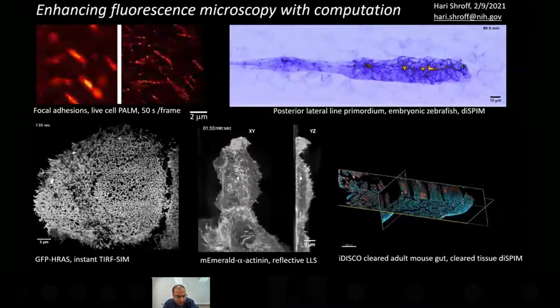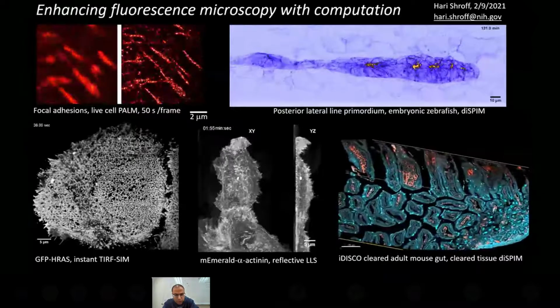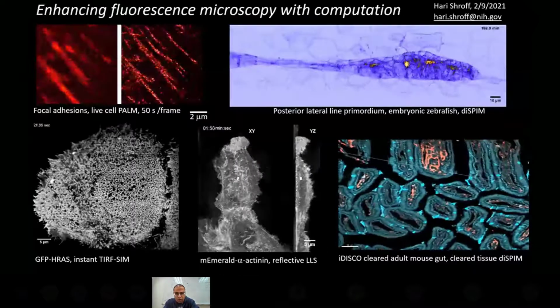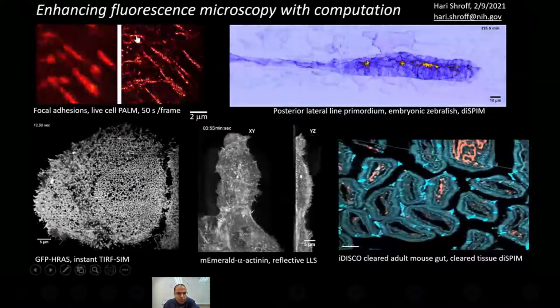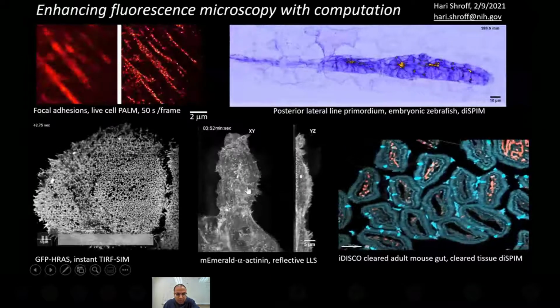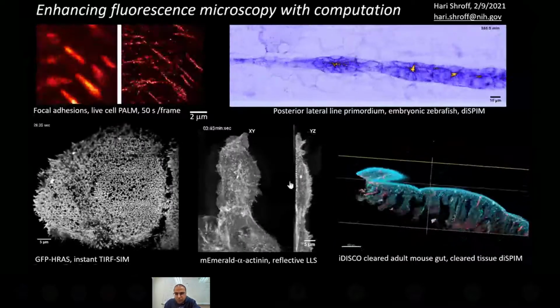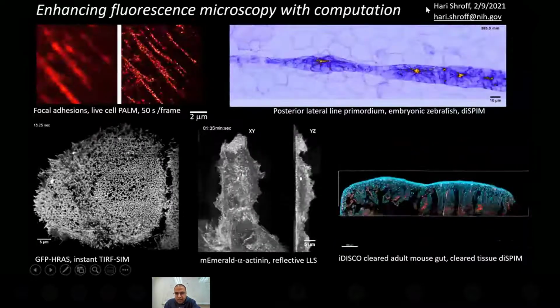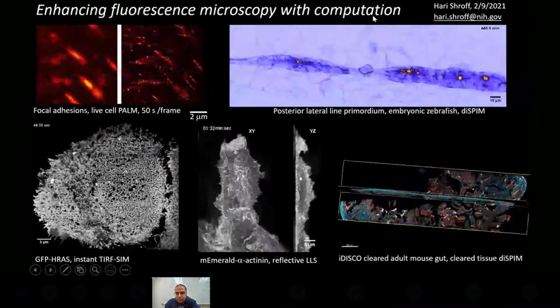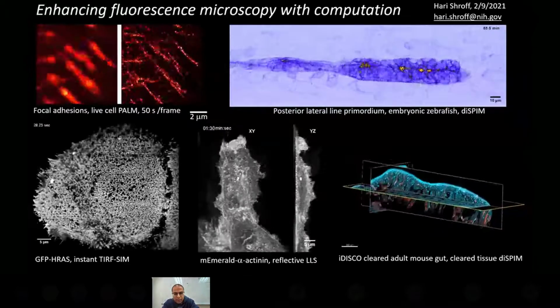So I'm not a deep learning person. I'm a microscopist, and I build microscopes to look at biology at different spatiotemporal scales, optical microscopes. Over the years, these have spanned everything from trying to image focal adhesions with live cell PALM to other kinds of molecules, cytoskeletal proteins in 2 and 3 dimensions across time, larger length scales, looking at groups of cells and embryos migrating, and then at even larger scales, more recently, I've been dragged into tissue imaging, imaging large sections of cleared tissue at cellular resolution.